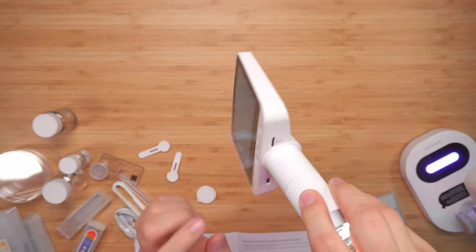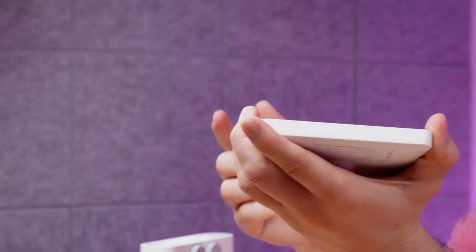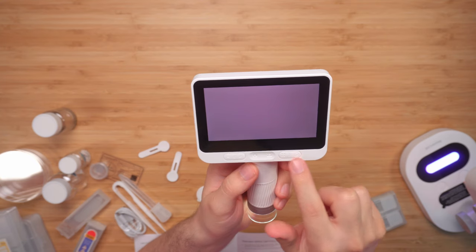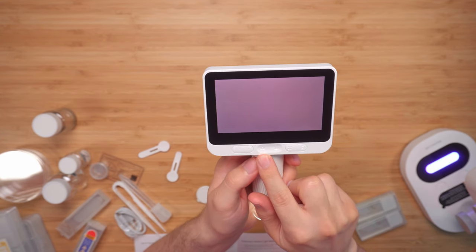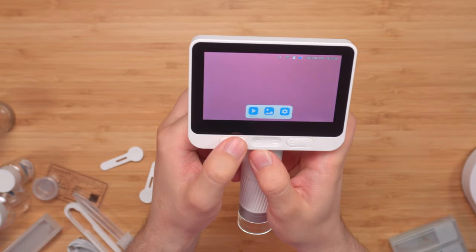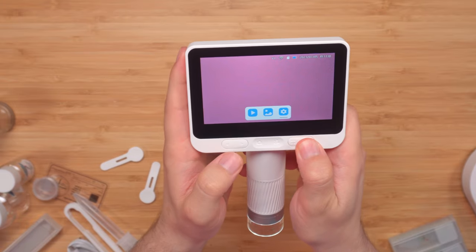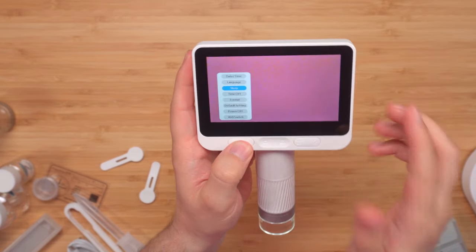On the bottom we have a USB Type-C port for charging and a micro SD slot — it comes included with a 32 GB card. On the front there are buttons: one to take pictures and one for video. Clicking another button lets you preview all your videos, pictures, and access the settings.